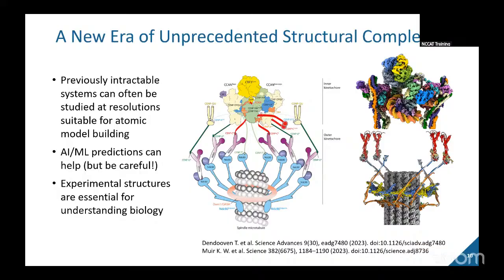And so we're seeing more and more that researchers are very quick to adopt these new robust processing strategies. It's easier than ever now to download high quality computed structures. You can fit that to experimental density. Then you could refine it using a combination of machine learning and classical approaches. This is kind of moving us more towards an automated model building process.